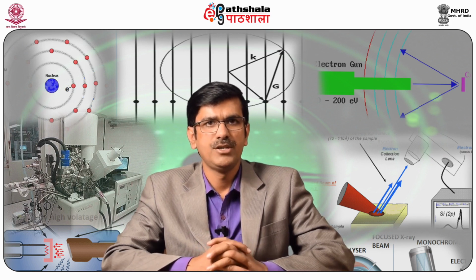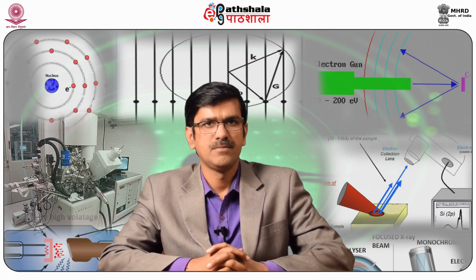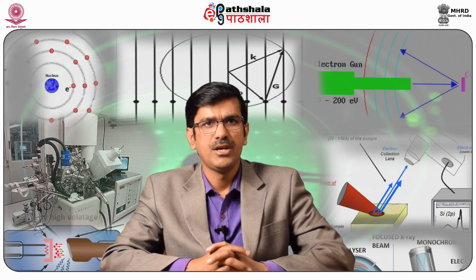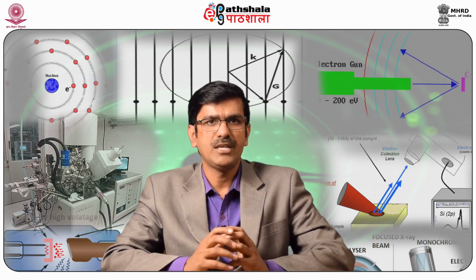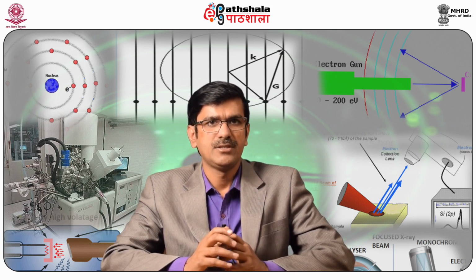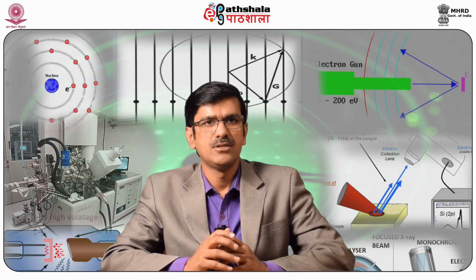Now about the transfer lenses. The performance of a HSA is strongly dependent upon the nature and quality of the transfer lens or lenses between the sample and the entrance of the analyzer. The presence of a transfer lens moves the analyzer away from the analysis position, allowing other components of the spectrometer to be placed closer to the sample.